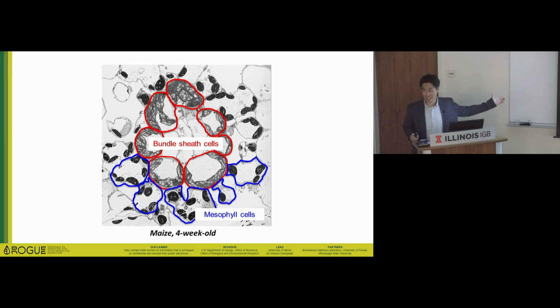There is a lot of information in this image. These days I'm thinking about working with other people, specifically on AI systems. Dr. Andrew Leakey's lab does some machine learning programs. They count stomata density, stomata size and shape. So it might be good for tracing. The machine can count the chloroplasts or cell wall, distinguish, trace, and detect them. That would save much more of my time, because this image has 500 slices. Right now I'm using HI, I call it human intelligence, so me. It's very painful, and not as efficient as AI. So that's my future goal.